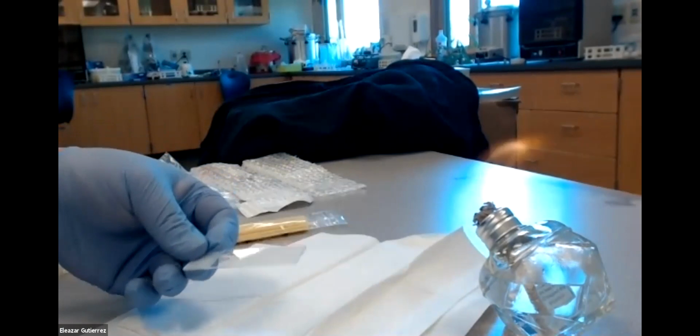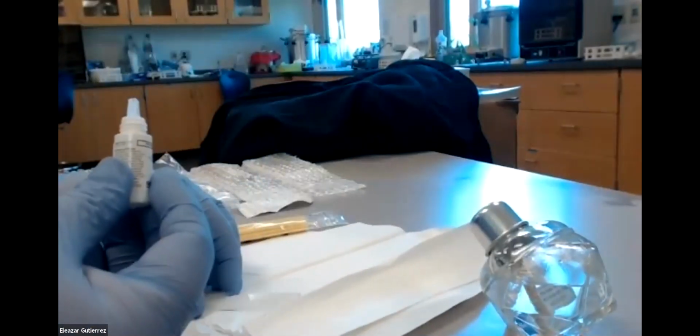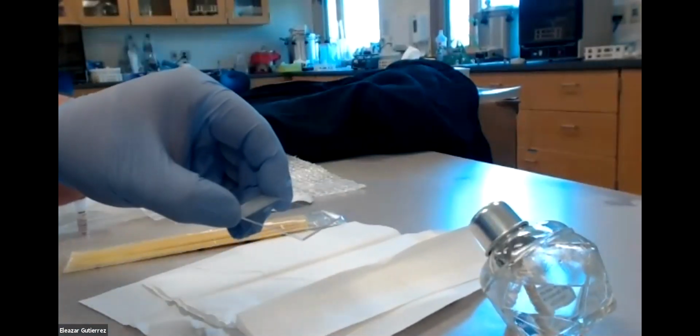And then I'm going to grab my huge bottle of hydrogen peroxide. Now I'm going to turn this guy off. We're going to add a couple drops to it. Let it go for a little bit.